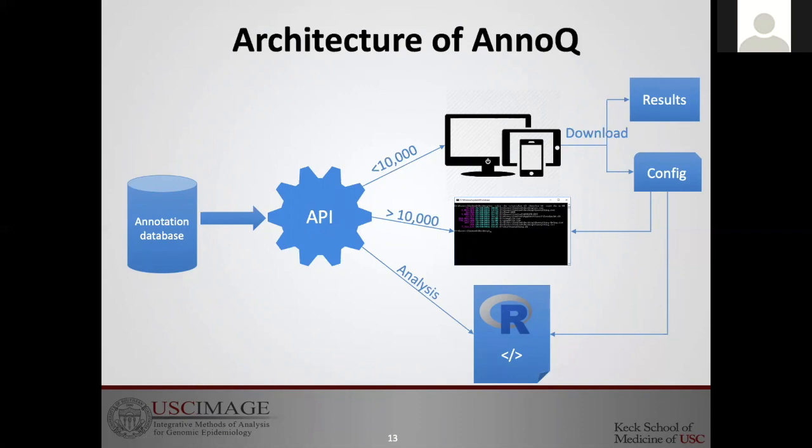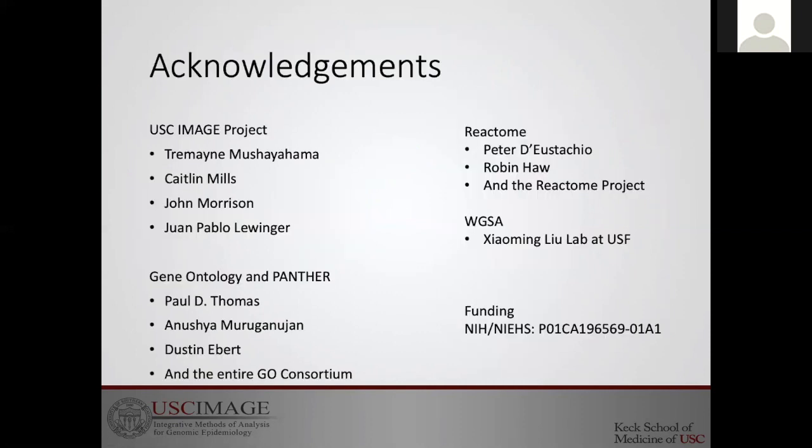You can annotate up to 10,000 variants using this interface, and you can view the results and download them, of course. You can also query, for example, by genome coordinates and gene identifiers, and retrieve a list of the variants associated with these query terms using this interface.